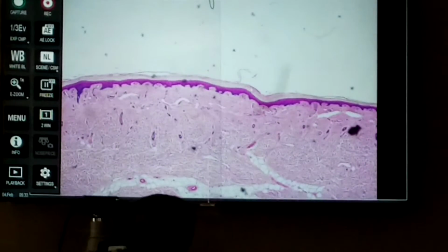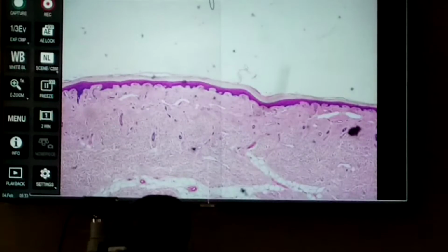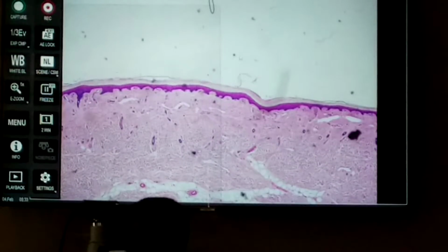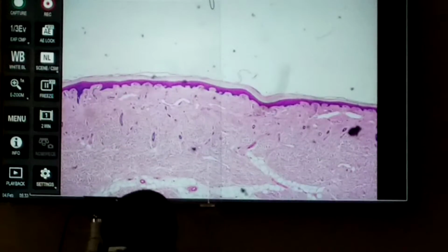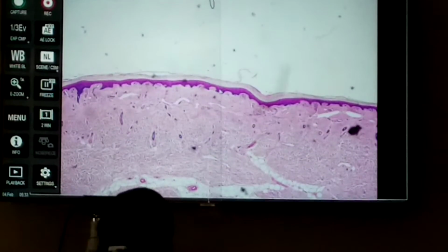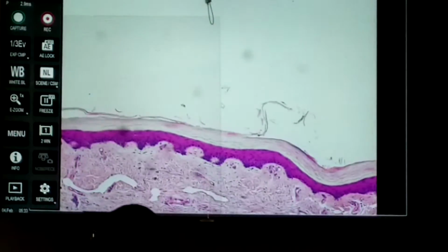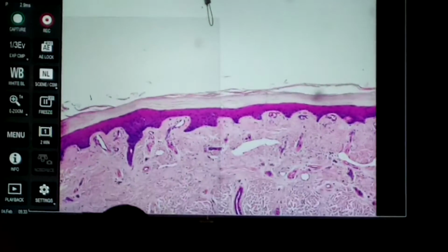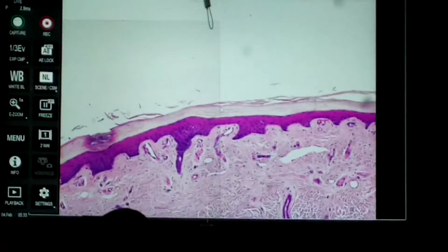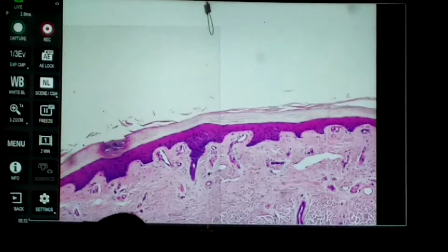Look, the surface epithelium will look for space, because it's going to line a space, either the exterior of our body or some type of cavity inside of our body. So if this is the space, then here's the epithelium. Let's look at it closely. What type of epithelium is this?